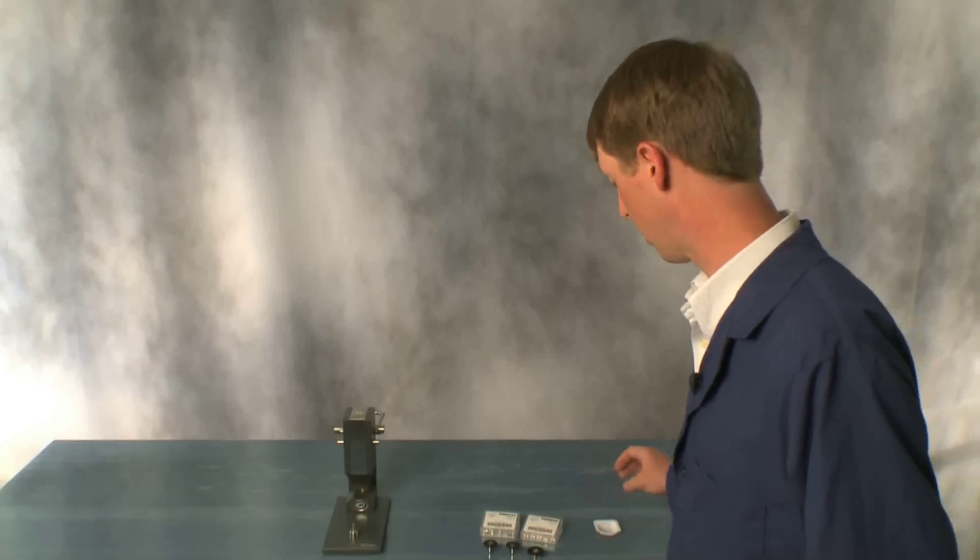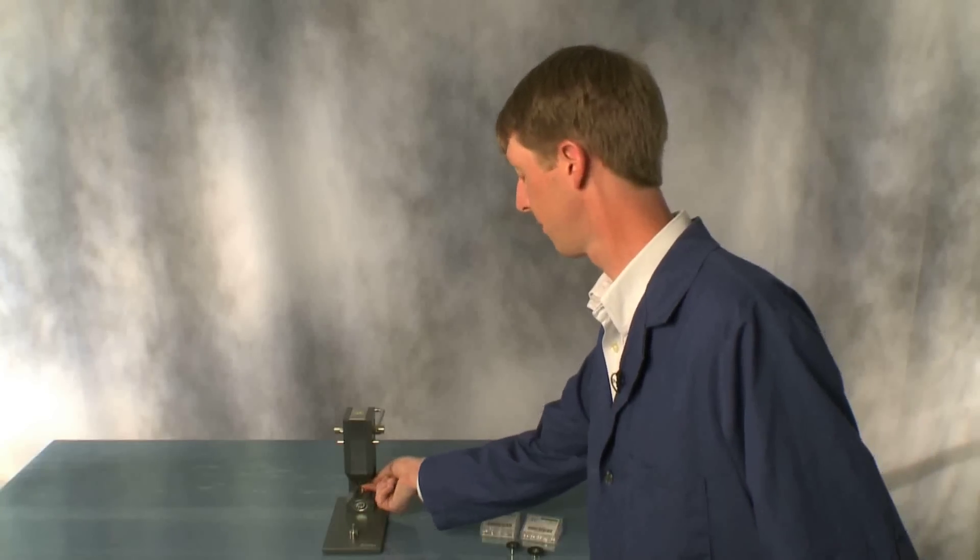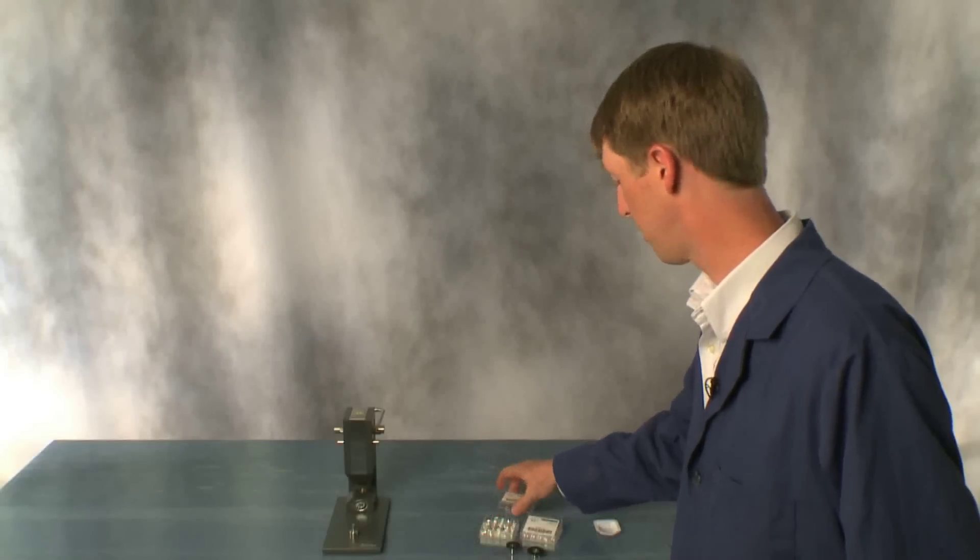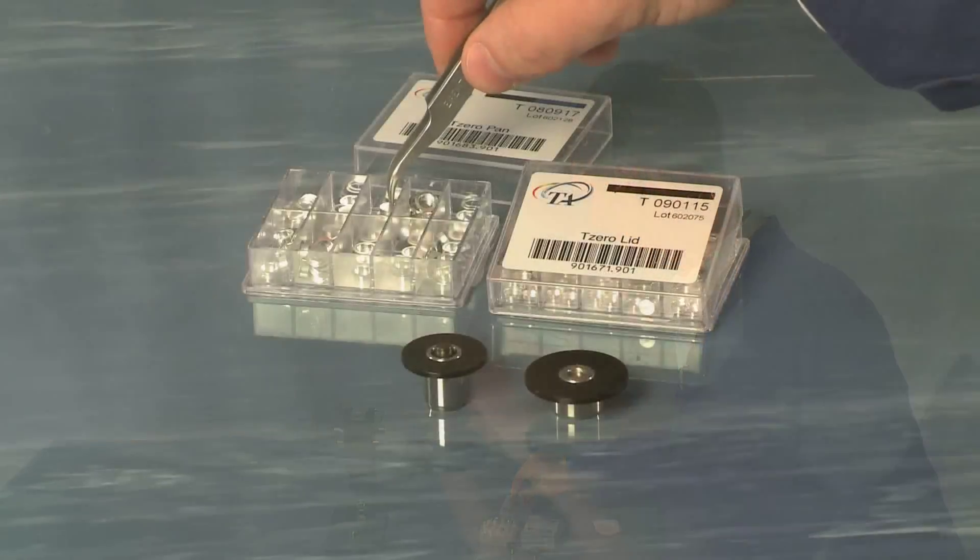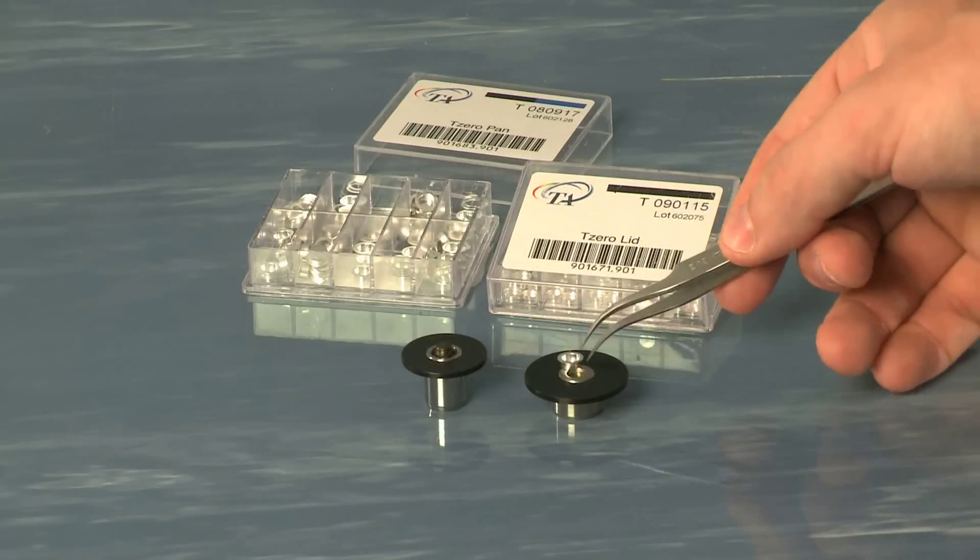First, take the hemispherical upper die and place it into the press. Then grab a pan and place that pan in the lower die.